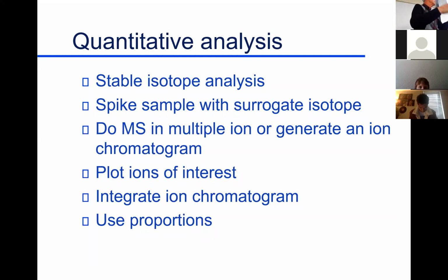If we had a good live audience and a lot of discussion, we could go through all kinds of thoughts about how you choose an internal standard. Have you spoken about that earlier? Sure. One of the basic principles is you want that compound to be like the compounds you're going to measure, so they behave the same way. If there are any losses, or poor extraction, whatever happened to be, that would be reflected in the internal standard. So you really like to have an internal standard that's as close as possible to the compounds you want to measure. And there's really nothing better than using an isotope of the compound you want to measure.